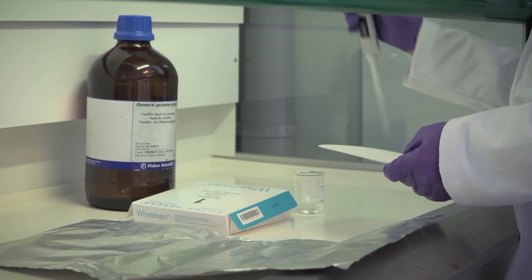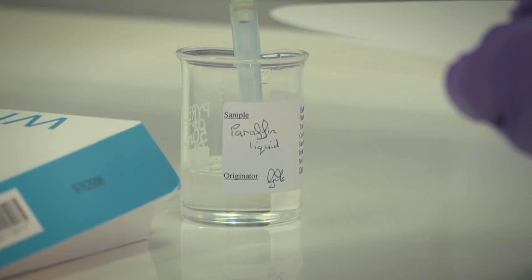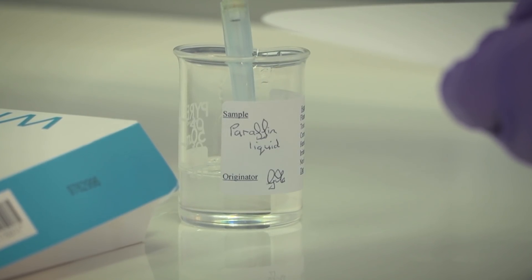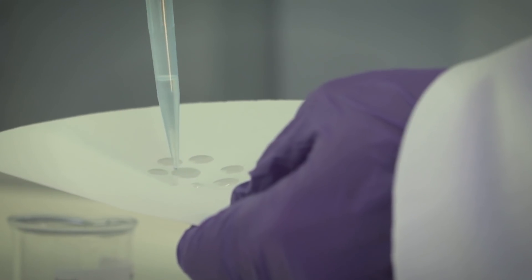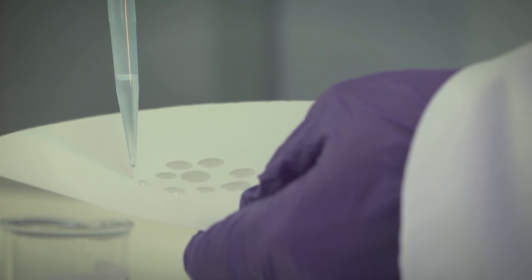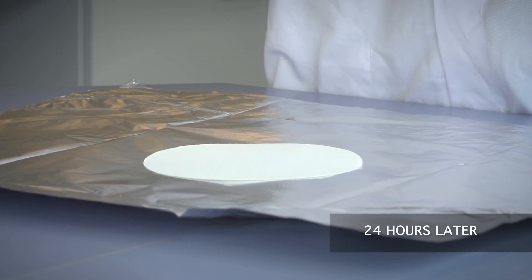We take a donor material — filter paper — and spike it with an oil simulant. We started using paraffin oil, which is a mineral oil saturated hydrocarbon shown to have fairly equivalent transmission as mineral aromatic hydrocarbon. This is then laid down into a foil package.